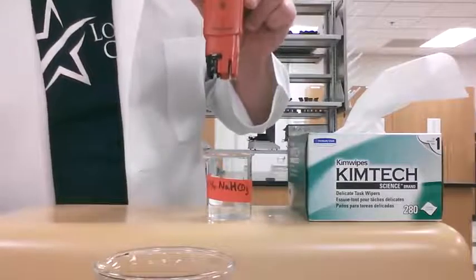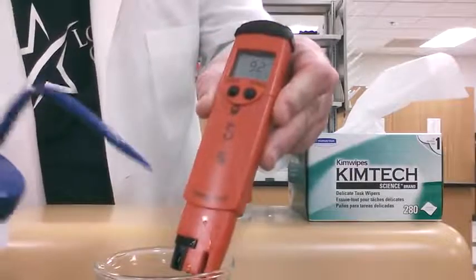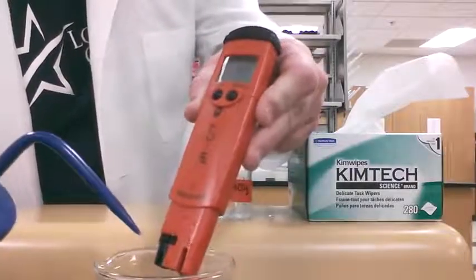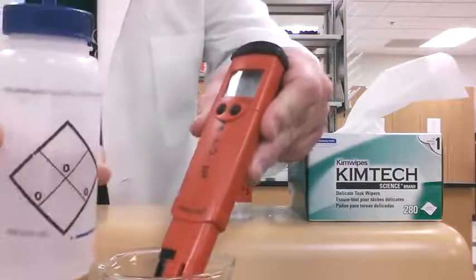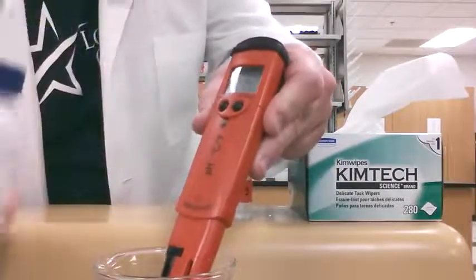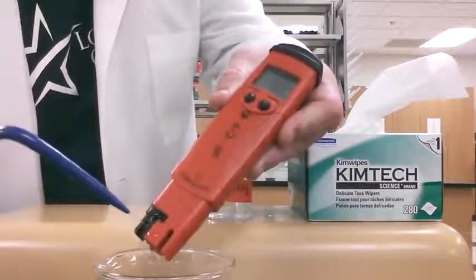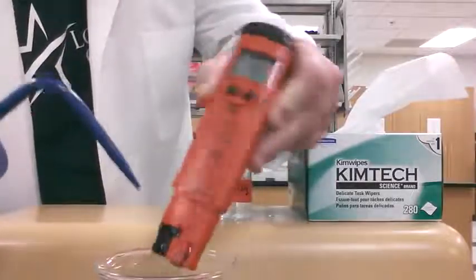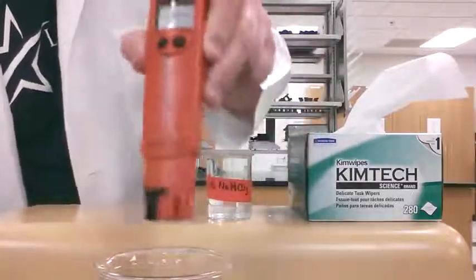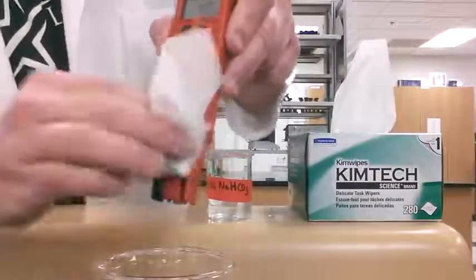We're going to rinse the electrode. I have a larger beaker that I'm going to use for rinsing. Hold the electrode over the larger beaker — you can hold it over your sink if you want. I'm going to use DI water from your table and rinse the electrode, getting in there really well and rinsing all around everywhere you have solution.